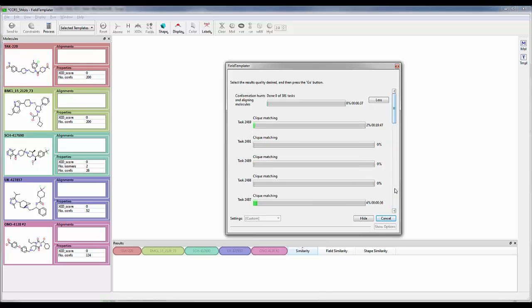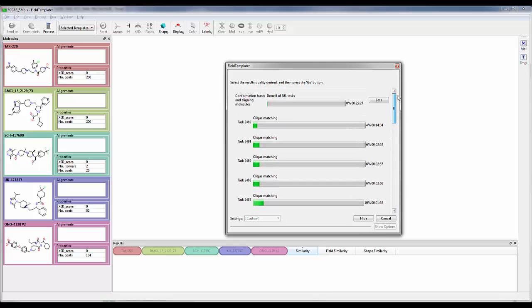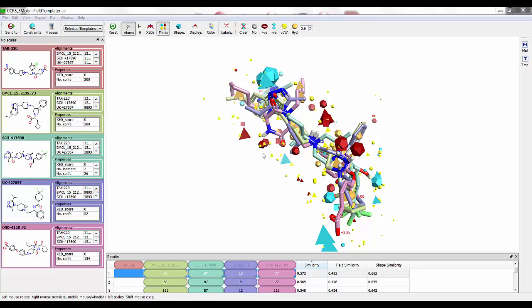And here they go. So now, in addition to the 4 local processors, I have the processors associated with the Cresset Engine Broker that are running on our cluster farm. Now, this experiment will take a little bit of time, so I will pause the recording and we'll come back when it finishes. The number of processors definitely influence how quickly an experiment runs.